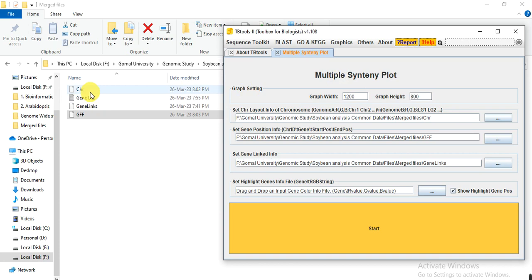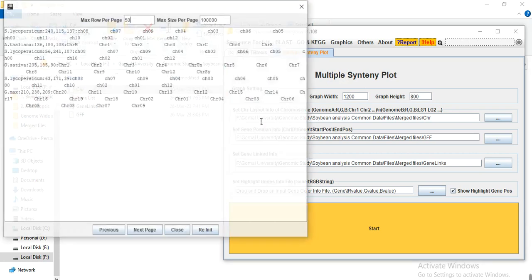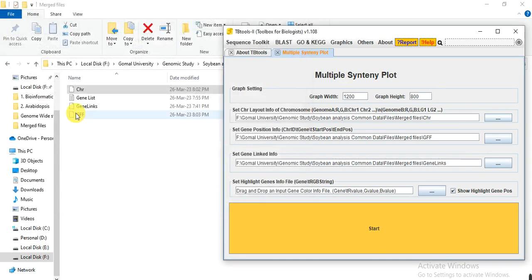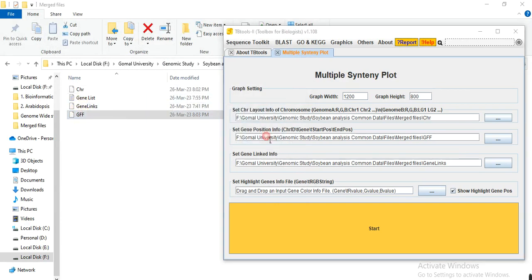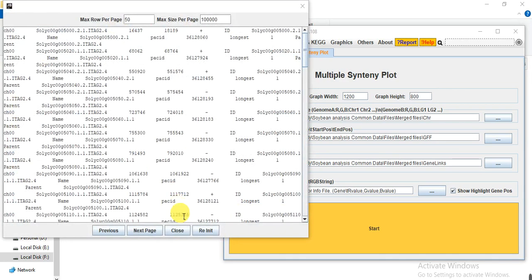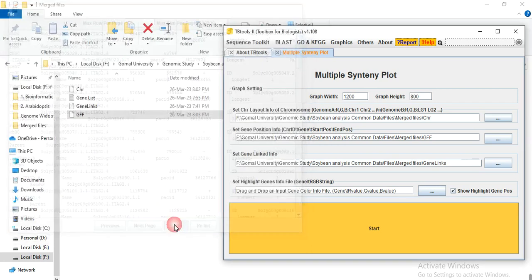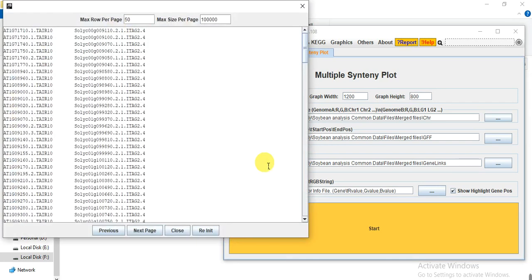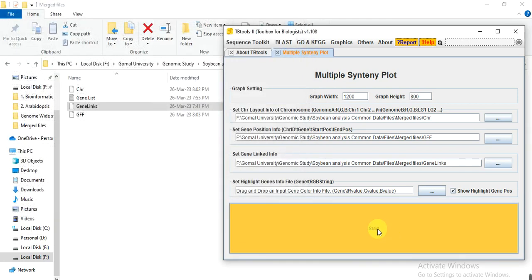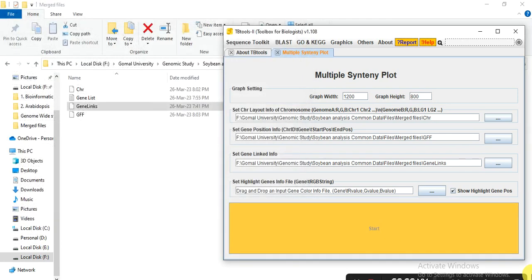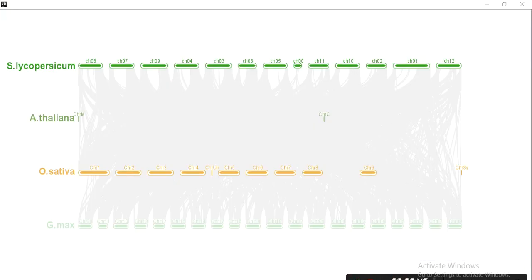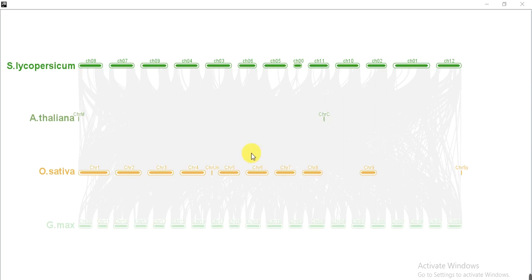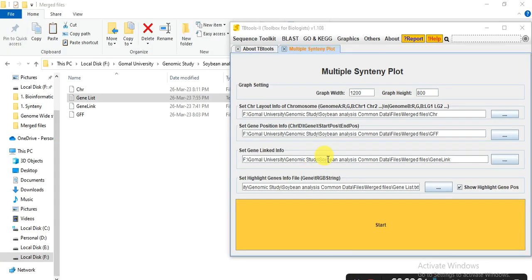Then we put all those files one by one again: chromosome, GFF, gene link. And then start to check. So here we are. So we have these only chromosomes of G.max, Oryza sativa, Arabidopsis thaliana, and Solanum lycopersicum.